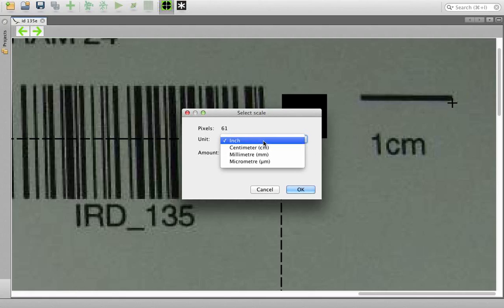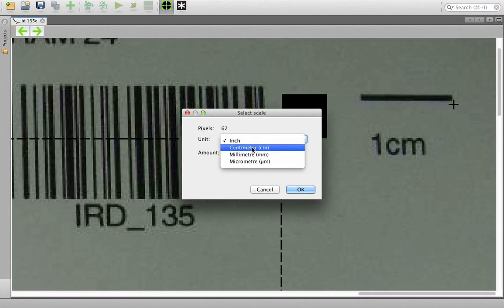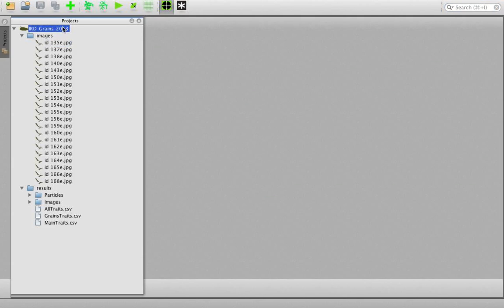So what I did is just drag, then right click, then you select this. Okay, I will do it again. So you drag, then right click. Here it is. You can do the reporting again here, as you can see.